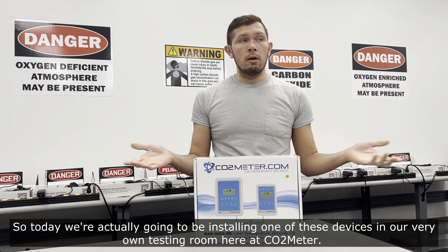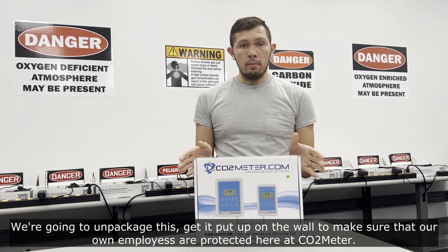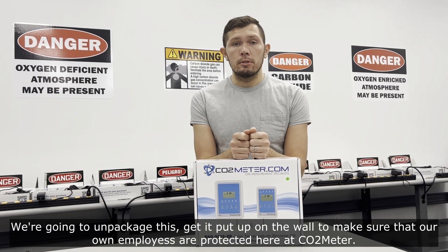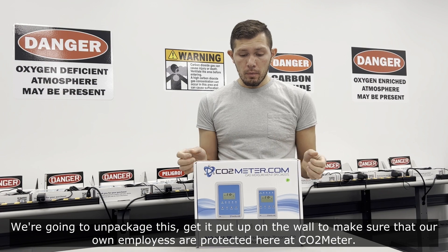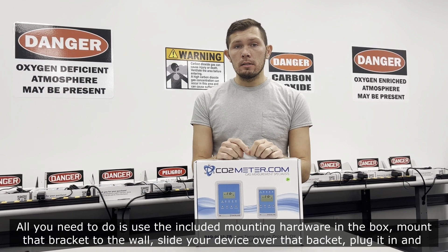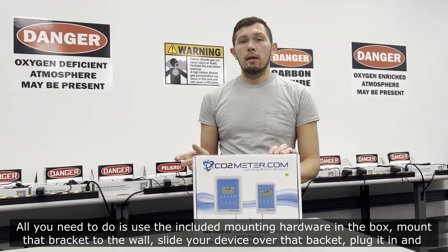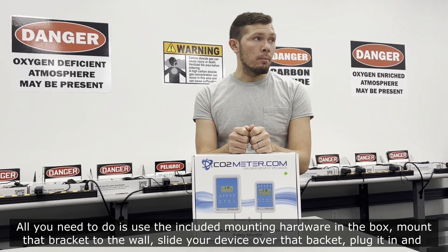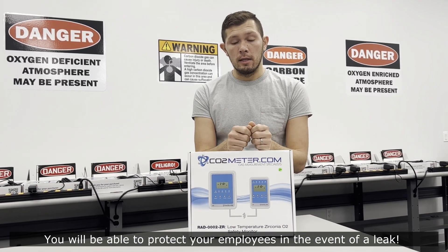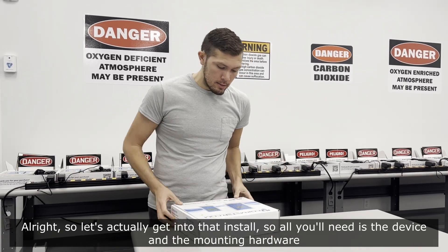Today we're actually going to be installing one of these devices in our very own testing room here at CO2Meter to make sure our own employees are protected. All you need to do is use the included mounting hardware, mount the bracket to the wall, slide your device over that bracket, plug it in, and you'll be ready to protect your employees in the event of a leak.